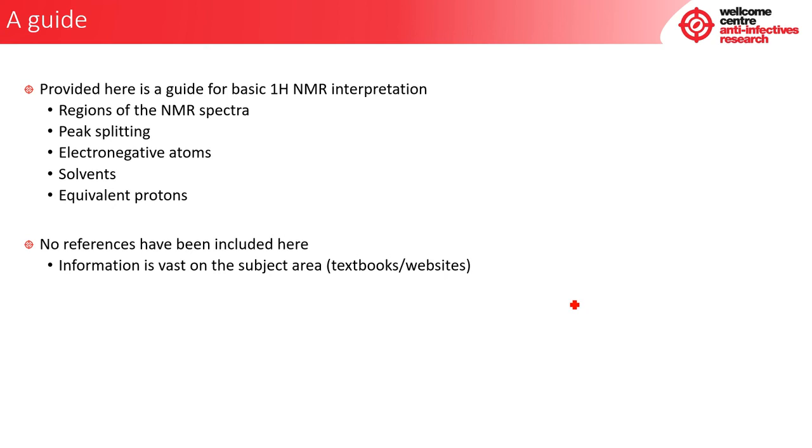Now, it depends on your background. You may not be a chemist, but at some point you might have to look at some of these spectra and have a rough idea, either to help your chemist or because you might be the only one on your project. So I think that these are very worthwhile rules to be able to understand your proton NMR spectra.